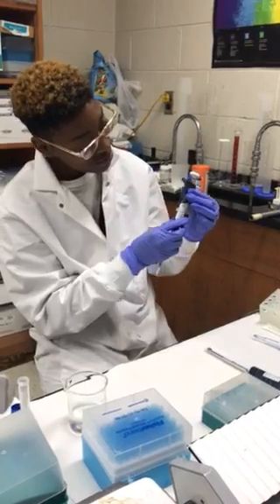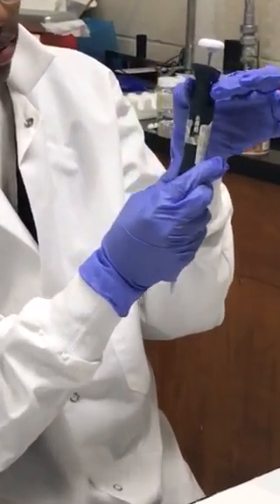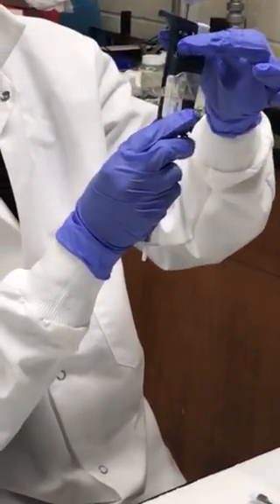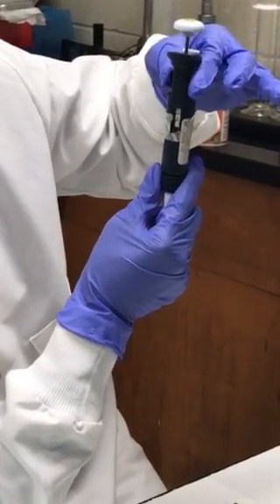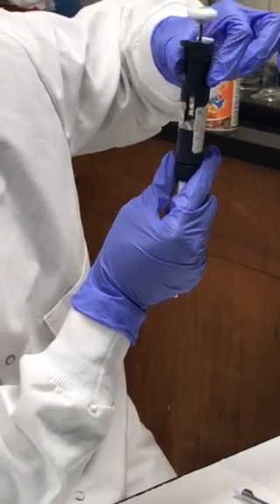By reading the volume of the pipette, the volume is set by turning the volume adjuster ring or the plunger. To decrease the volume, screw the volume adjuster ring or plunger left. To increase the volume, screw the volume adjuster ring or plunger right.